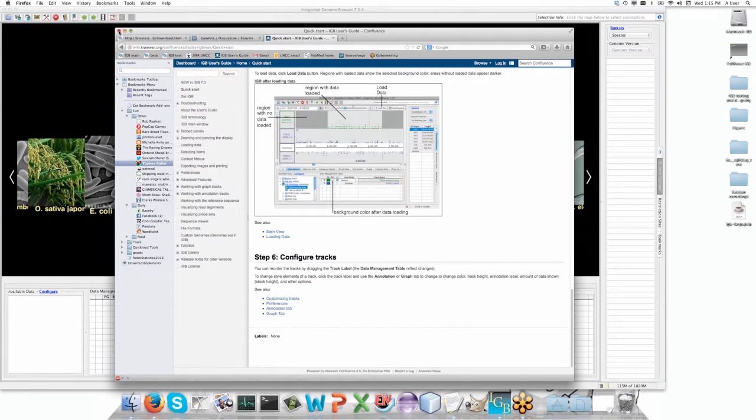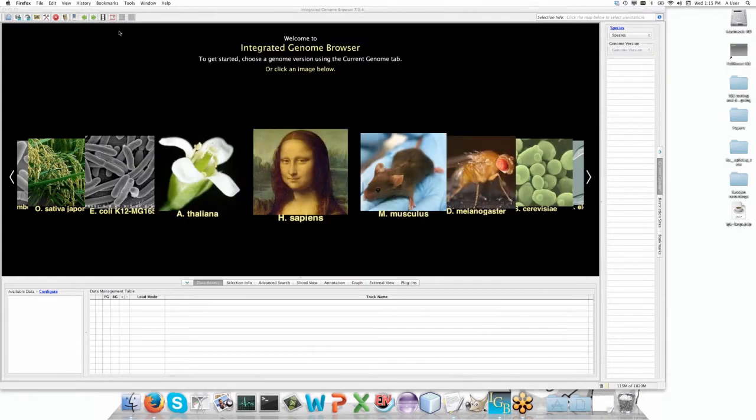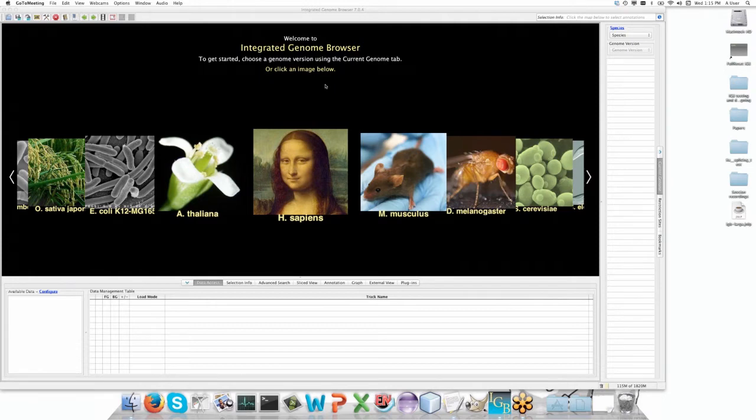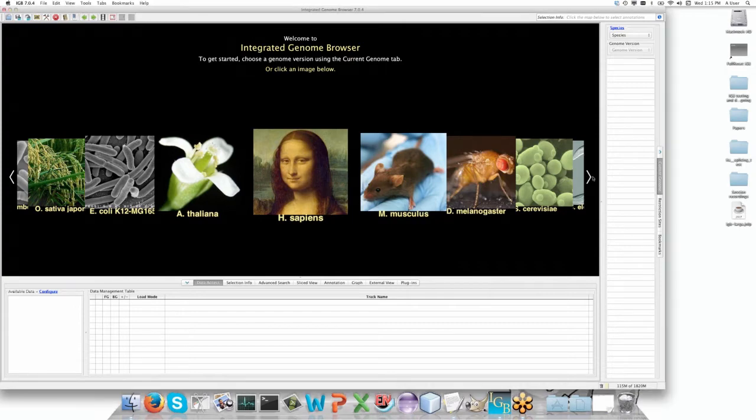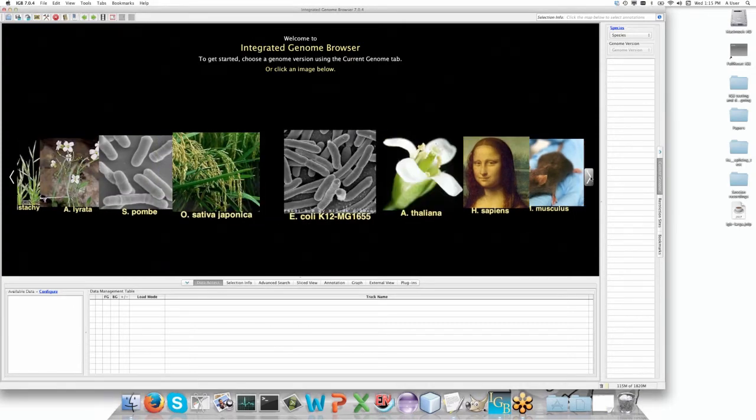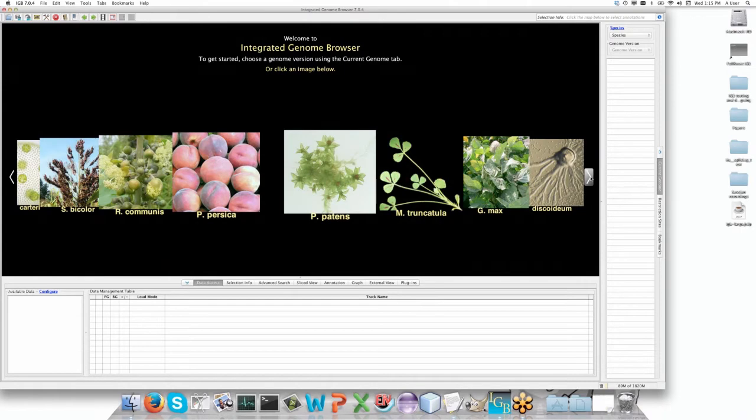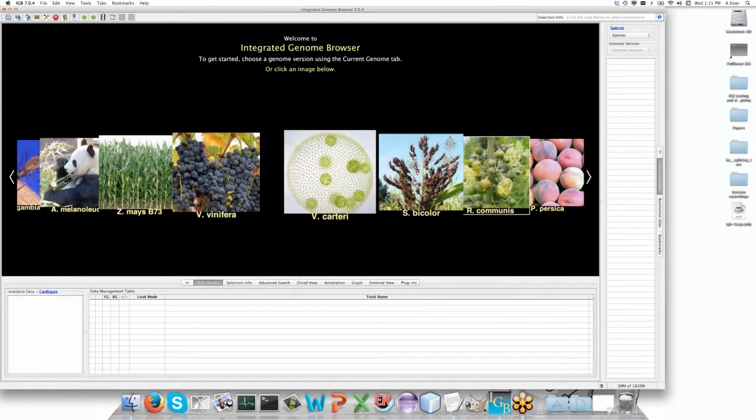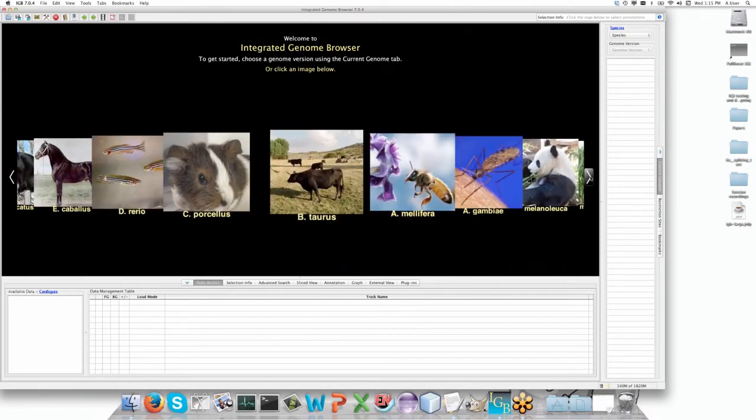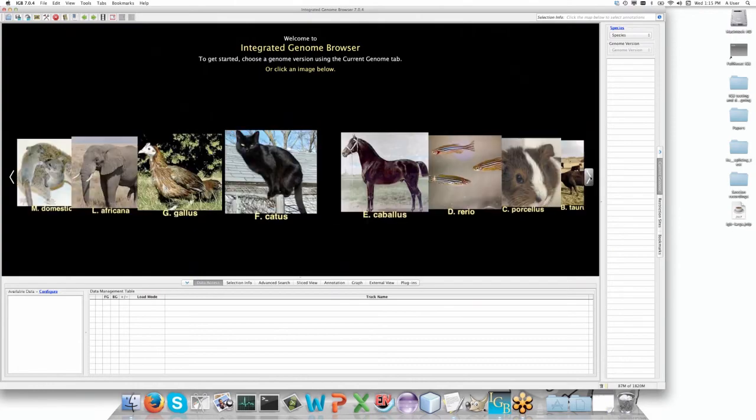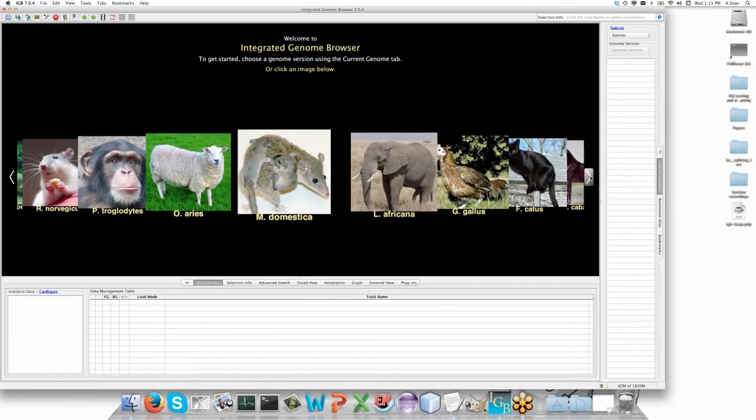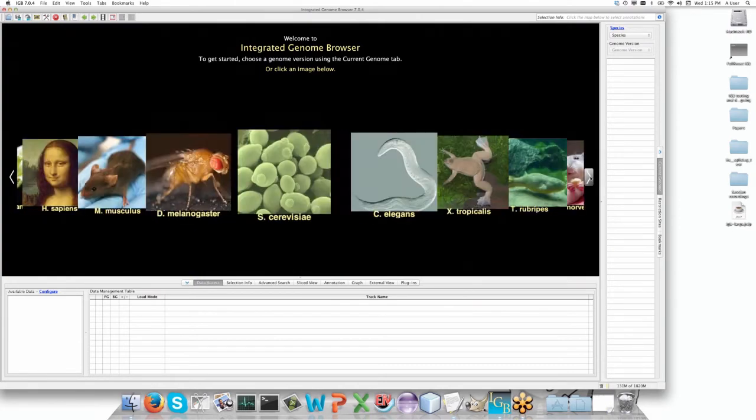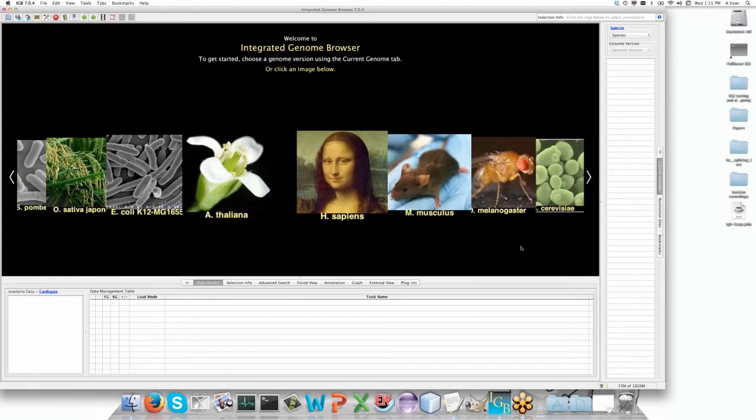I'm going to get this out of the way. Obviously I have made the screen full size so you can all easily see it. This is the starting page of IGBI. You can see here across these pictures quite a lot of them - there's lots of plants, lots of animals. These are the quick one-click jumps that will take you to the genome that you're interested in.